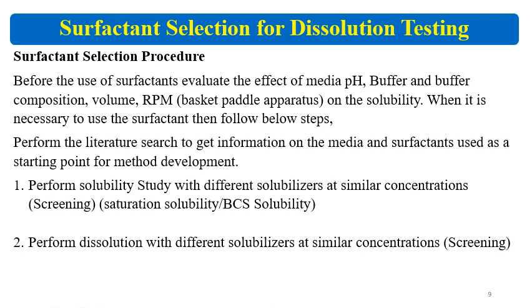Only when it is very much necessary to use surfactants to get the sink condition and dissolution should they be used. So first, before going for the surfactant selection, perform a literature search to get information on the media and surfactant used in dissolution testing, so that you can use it as a starting point for your method development.